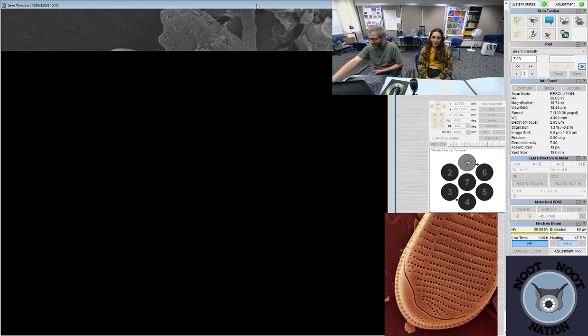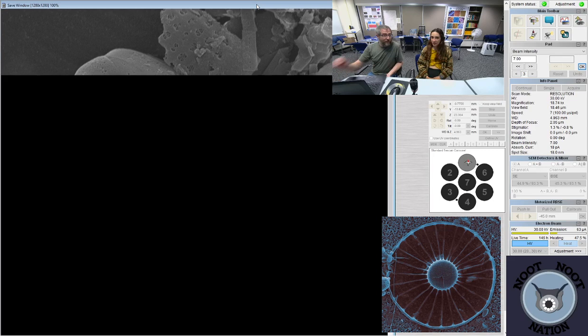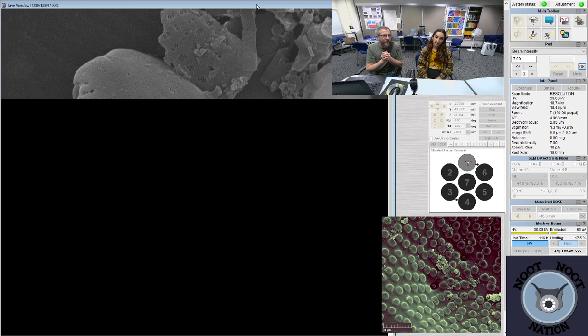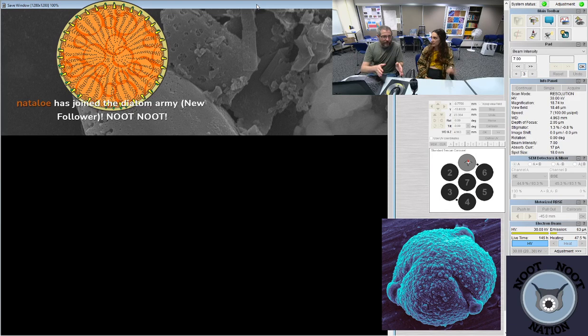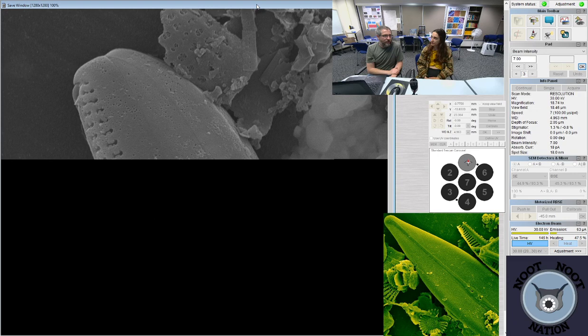Mean Machine Rex wants to know what would happen if I don't coat them with metal. They would charge up, which means... You couldn't see anything, right? Well, you'd still be able to see them. They would just have really bright boundaries anywhere there's an edge, because the electrons would have a hard time escaping the surface. The metal coating is mostly so that the electrons charging on the surface will easily find a ground. They're going to roll off of the diatom, and because there's metal all the way down to the aluminum stub that they're on, the aluminum stub will allow the charge to go into the ground on the machine.